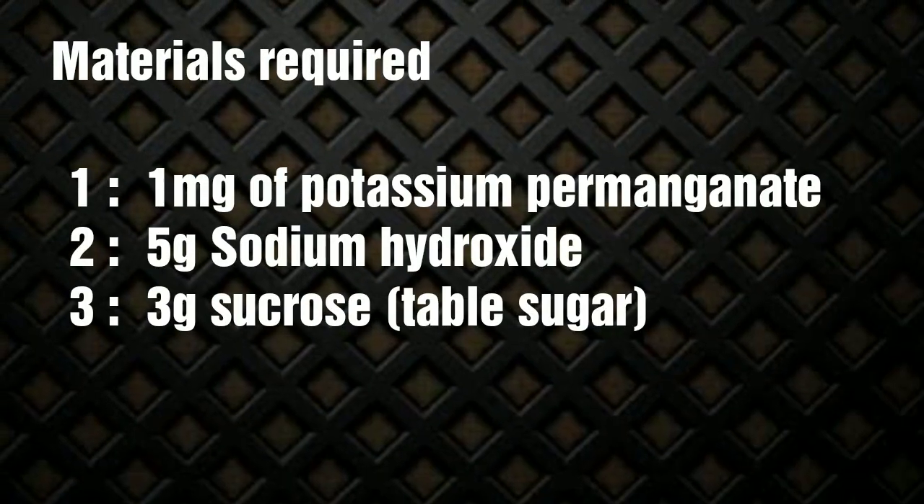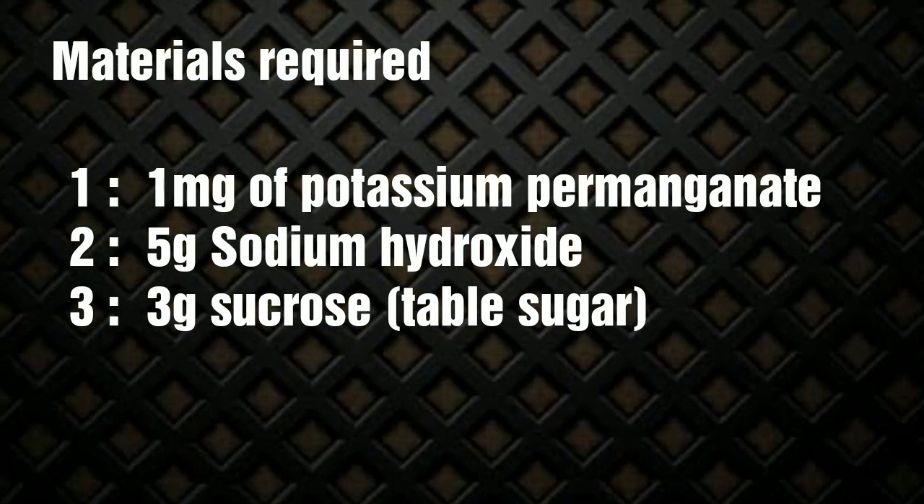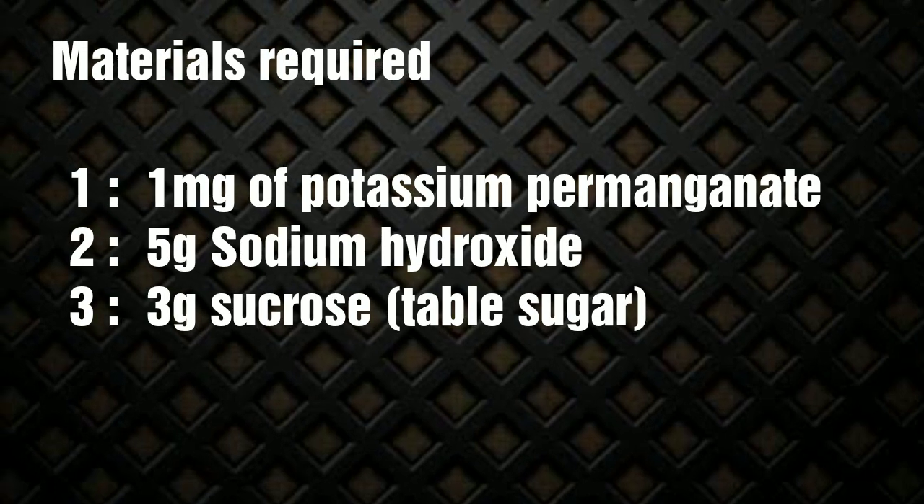For this experiment, we require a very small amount of potassium permanganate, that is around 1 milligram, then we require 5 grams of sodium hydroxide and 3 grams of sucrose.